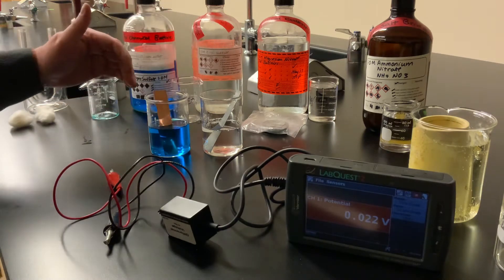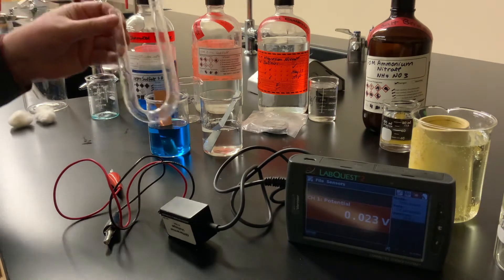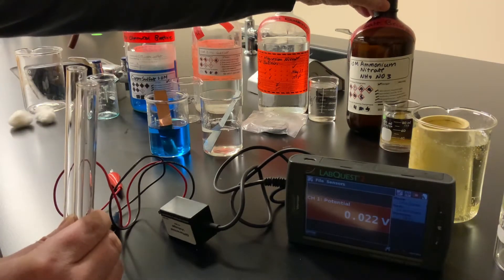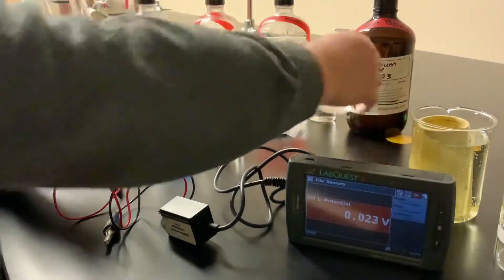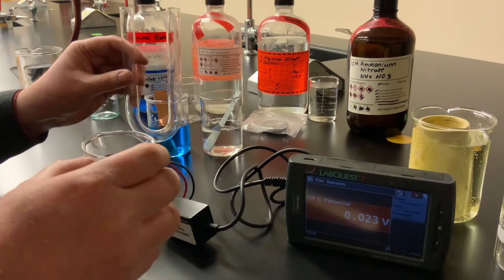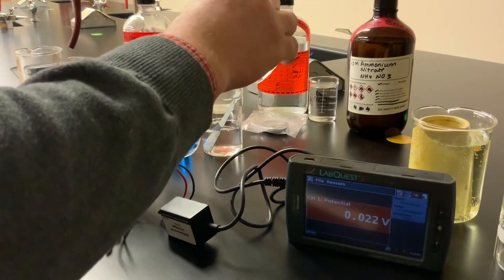Now we have the two half cells, but we have to connect them to complete a circuit. There are different ways you can do this. The standard way that you'll see in most textbooks is a U-shaped glass tube — we'll just call it a U-tube. I'm going to take another solution: ammonium nitrate, which is a salt solution at about one molar concentration. It has ammonium ions and nitrate ions, which are going to conduct electricity through the salt bridge. So I'm going to fill the U-tube with the ammonium nitrate solution.